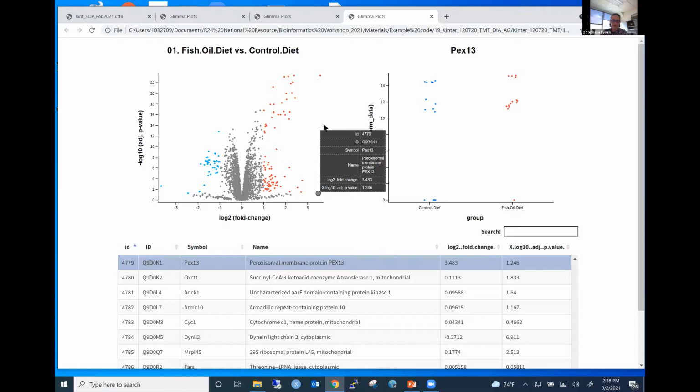But yeah, we would provide all of this data as the end results, zip all that up, and give it to the end user along with the Scaffold file and all of the raw MaxQuant output so you can do any type of analyses. Ultimately, what we'd like to do is partner with the IDeA states. Whenever a user comes from a particular state, we can connect them to one of the other bioinformaticians who can help with downstream processing, pathway analyses, and any extra analyses they want to get to a publication. I'm really hoping we can utilize this network to provide that resource, help one another out, and help our end users get to publications. I would love to have that happen because there's a lot of data to look at.